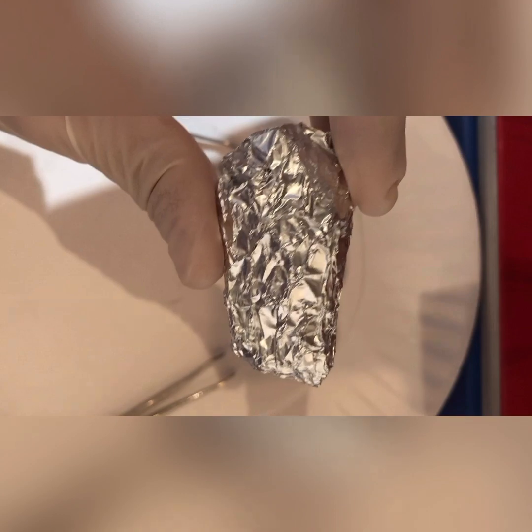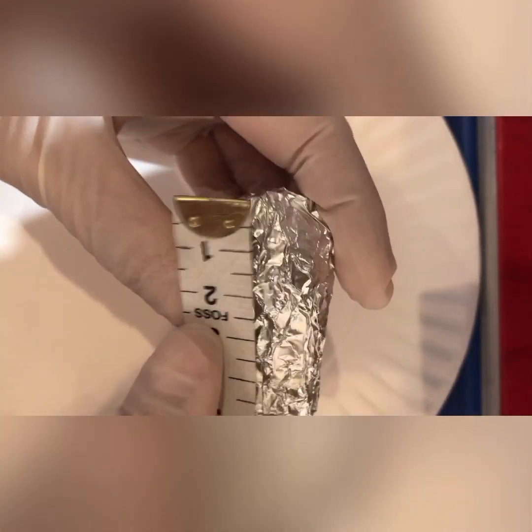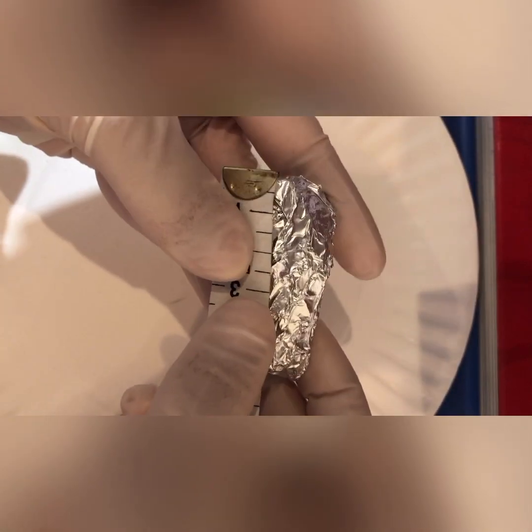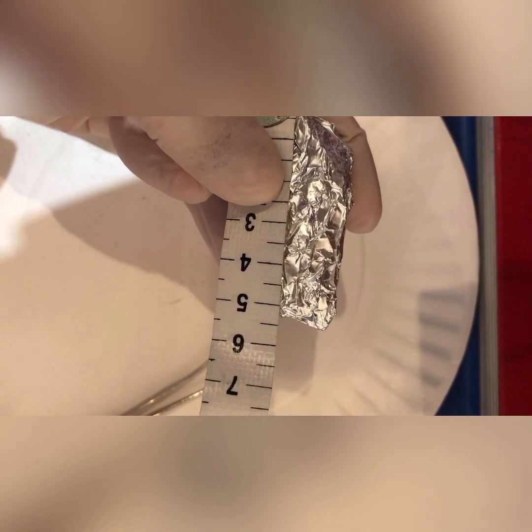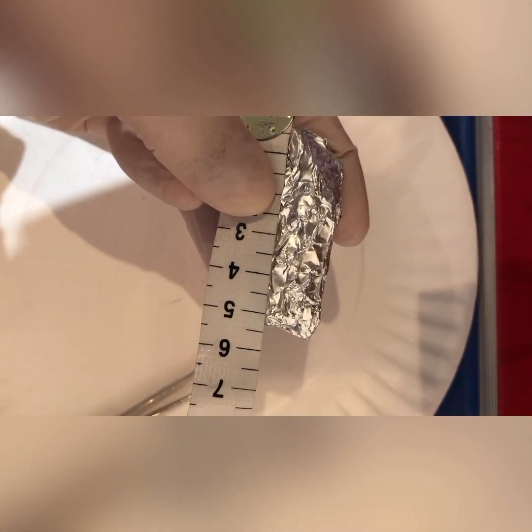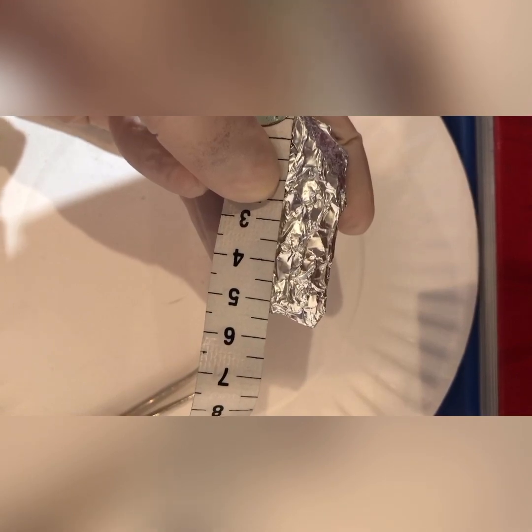The first thing I'm going to do is use a tape measure and measure both the length and the width. I'm going to measure it from one side to the other, and we'll see this is about 5.5 centimeters, and I am going to record that on the side, and that's the length.